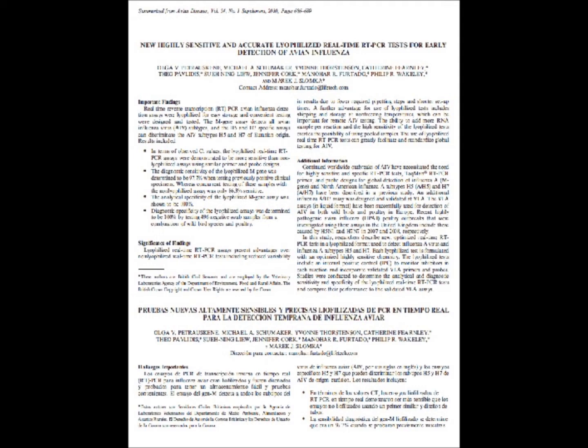The last thing I'd like to say is because of the lyophilization, you can now add a larger volume of your sample. So typically, if you're setting up a 50 microliter reaction in the liquid format, you may be able to accommodate somewhere between 15 to 20 microliters of the sample. In a lyophilized reaction, you can put in as much as 50 microliters. So there's a big difference in terms of how much material goes into the reaction to be tested, and that helps with sensitivity.